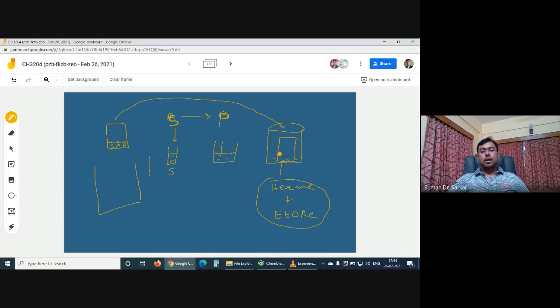All right. And this is very important: the mark we have made should be some distance above the solvent. This mark should never be deep in the solution. It should be up there. Suppose the solvent layer is up to here, 1 centimeter. Then the distance from the bottom to the mark must be 1.5 or something like above 1 basically.